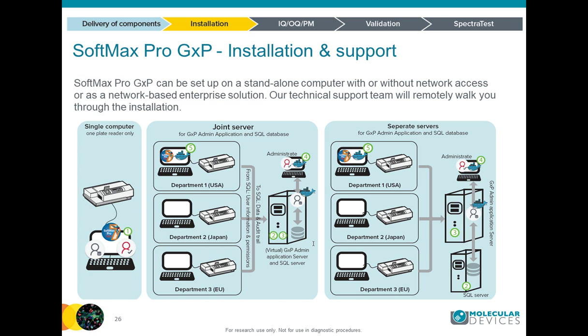Great, thank you. Our next question is, would you please clarify whether the data integrity features apply to a single computer setup? Yes. I'm not entirely sure about the question, so if I don't answer it correctly here, please send me an email afterwards. But the data integrity guideline actually applies to all three setups. So this is independent of the computer setup.